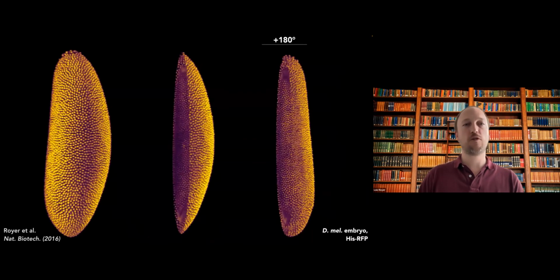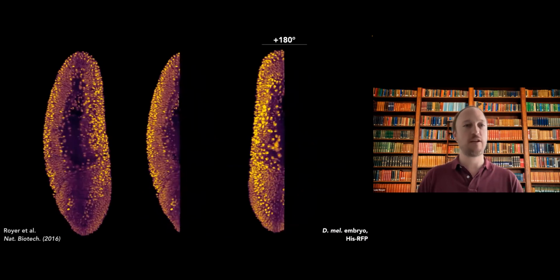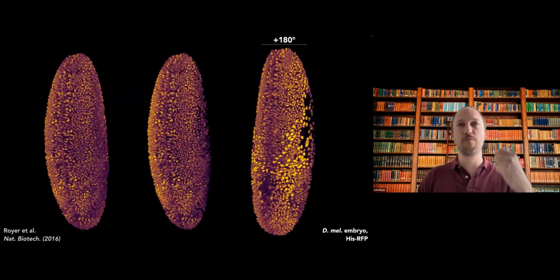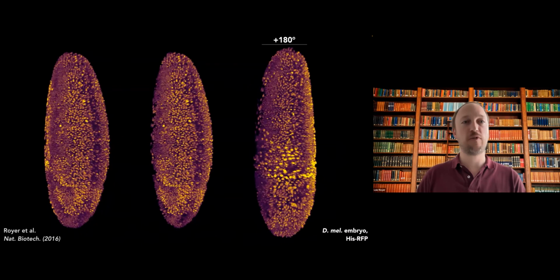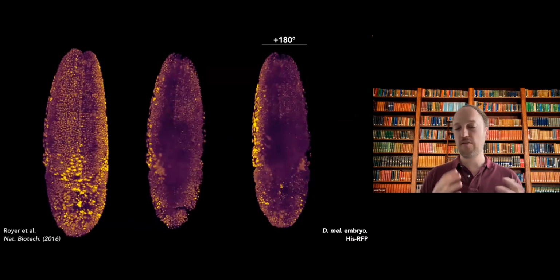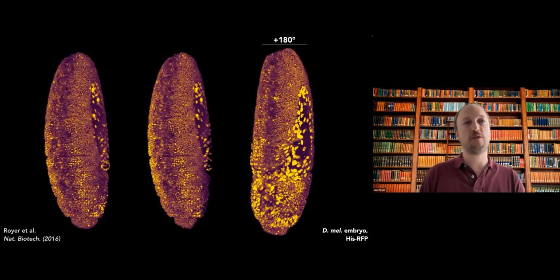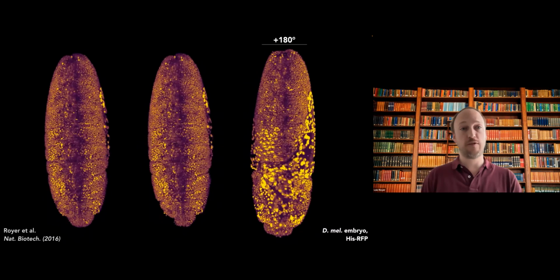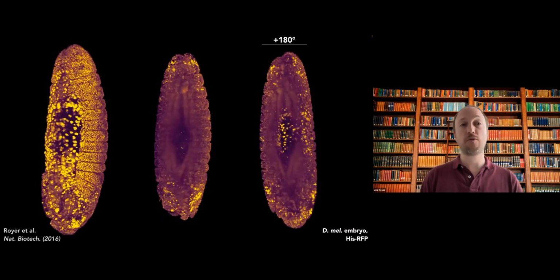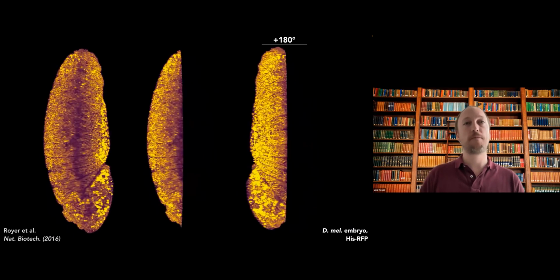And so with Philip, we were, of course, working on this autopilot project. We also had to visualize things. So here, for example, are some stacks that were rendered with ClearVolume at the time. And really, another thing that exposure to light sheet and advanced bioimaging taught me was that you really need to look at the data in 3D. And so that also informed a lot of decisions for napari going forward. And you'll see that in a second.